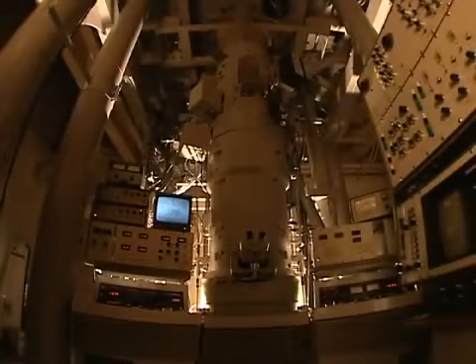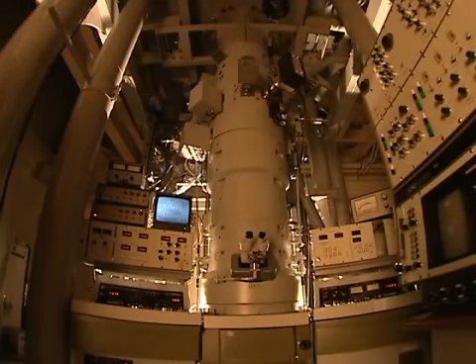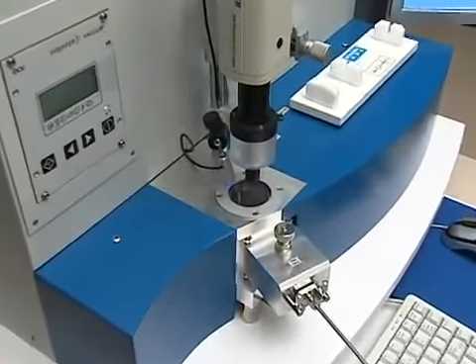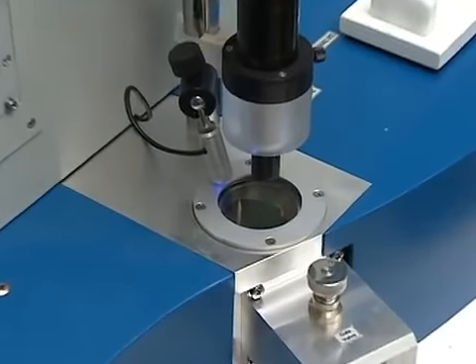Let me introduce another example that observes thick samples easily. Let's go back to the solder joint. It is of course useful enough to observe solder joints by electron microscopy. However, wouldn't it be more interesting to be able to observe the soldering process itself, at high magnification, and in real time? When asked this request, specialists in electron microscopy would normally claim that it is absolutely impossible since solder joints contain liquid metal. Nagoya University is an exceptional group that is able to challenge this issue.